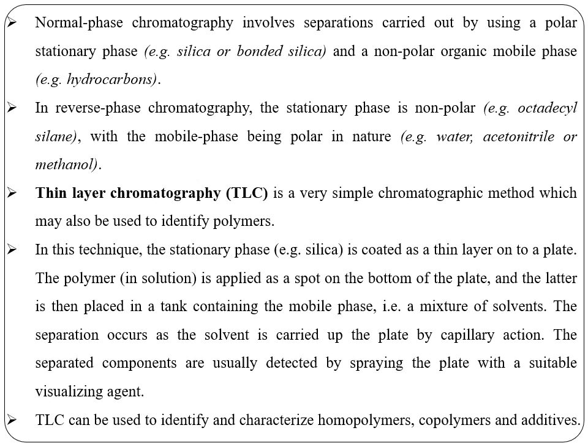The mobile phase is usually a mixture of solvents. The separation occurs as the solvent is carried up the plate by capillary action. The separated components are usually detected by spraying the plate with a suitable visualizing agent. TLC can be used to identify and characterize homopolymers, copolymers, and additives.